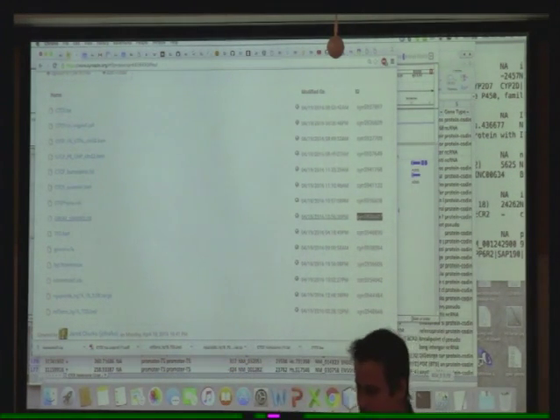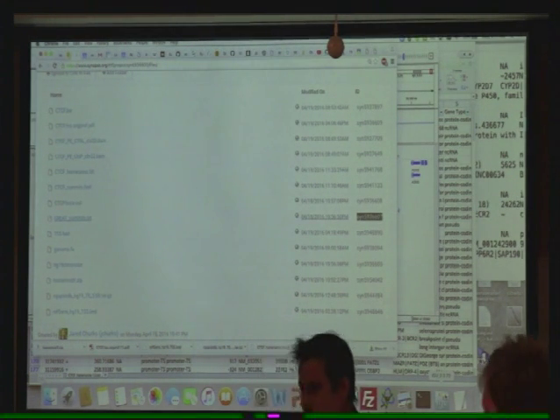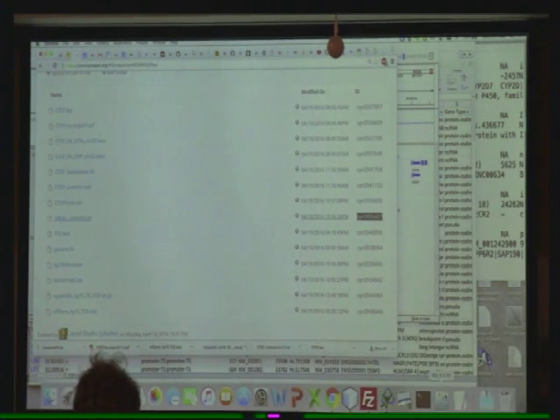She's actually in Next to Go. That's Next to Go, yeah. This is Next to Go. It's just not going to MNT for some reason. Oh, it's not? IGB, yeah, it's a weird thing. We don't know why. Yeah, if you do file, load file.